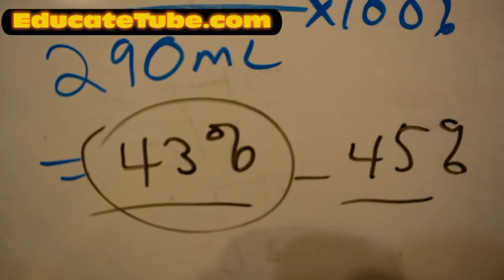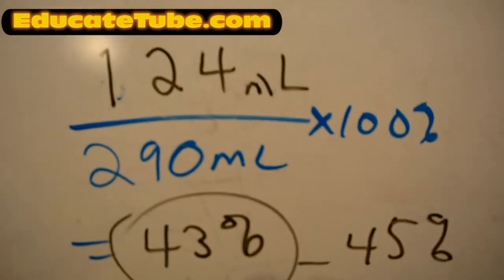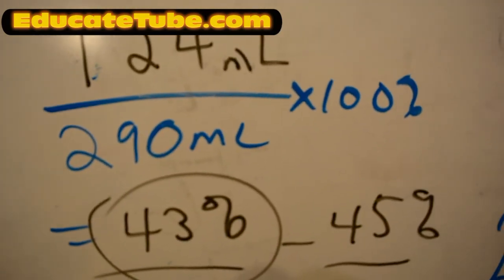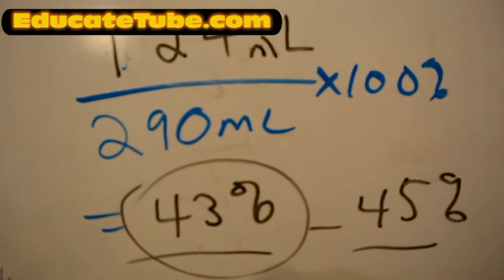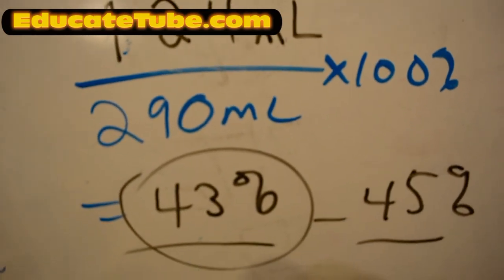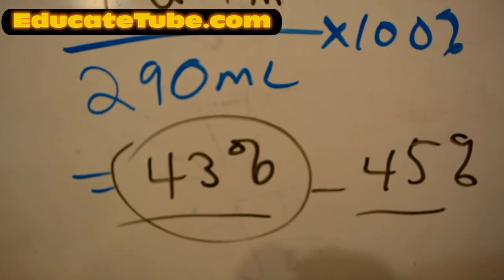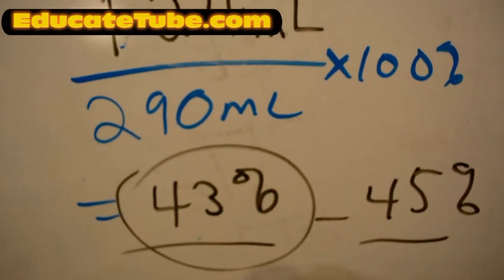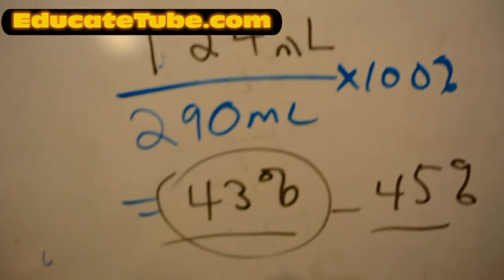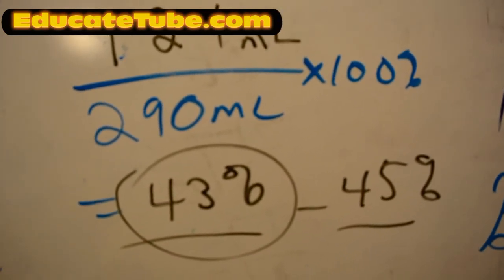Anyway, that's what I did get. I was supposed to get 290 milliliter, but I ended up getting 125, 126 milliliter. 124 is this one here. So it's consistent. So 124 to 126 milliliter, and that gave me between 43 to 45% yield. Interesting. We definitely have to repeat this experiment again, but I think this is it. This is the result that I got.